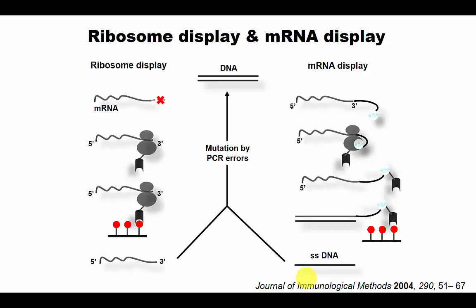Ribosome display or mRNA display can have even higher diversity than phage display. In the ribosome display case, the idea is utilizing mRNA, which can be prepared from cDNA, and cDNA represents the transcriptome. Those libraries can be expressed as mRNA, and then mRNA can generate protein. By modifying the end position of the mRNA, by removing the stop codon, we can prevent dissociation of the mRNA after translation is over.